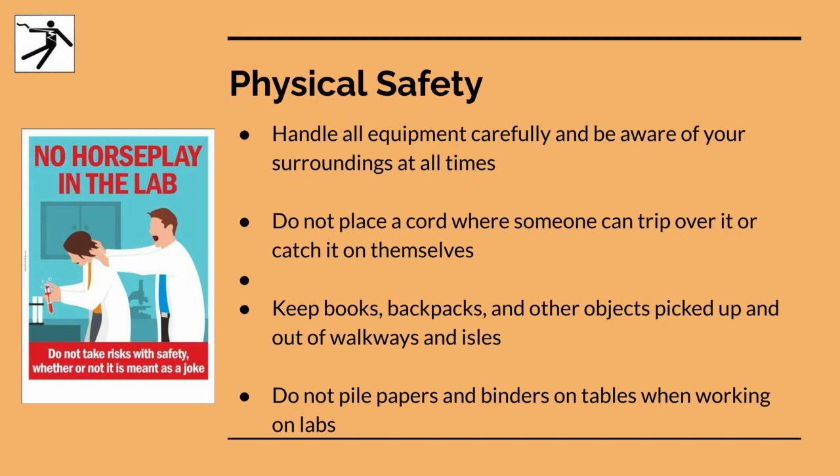Okay, physical safety. So handle all equipment carefully and be aware of your surroundings at all times. Super easy, super common. You should know this already. Do not place a cord where someone can trip over it, or catch it on themselves. Now, this is especially true right now that we've all got Chromebooks. You've got to be cognizant of where you're plugging things in and how people can trip on them. So even if we're not in the lab, don't be a jabroni. Don't keep cords in a way that someone could easily trip over them.